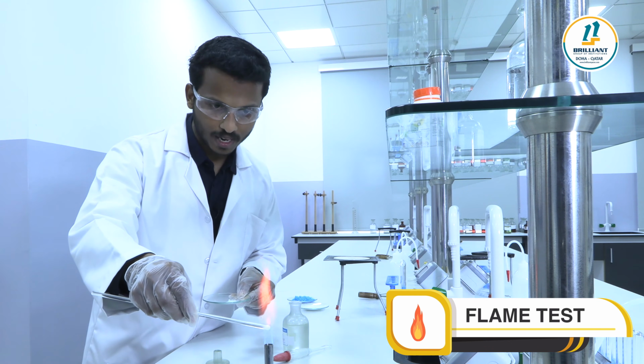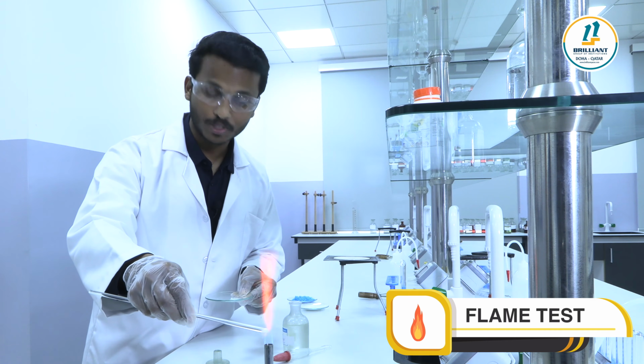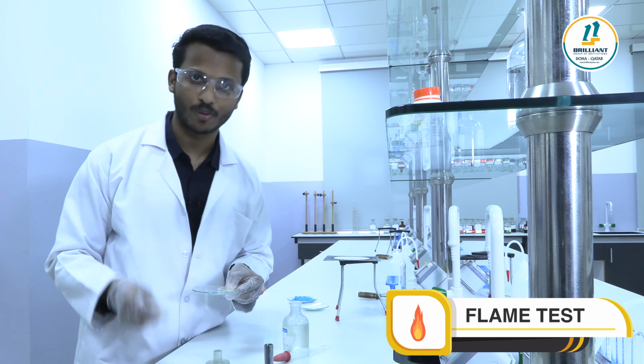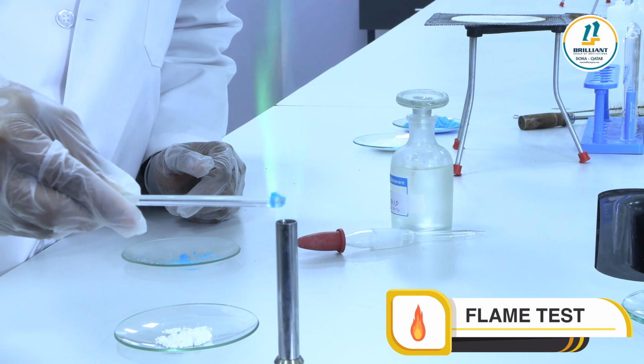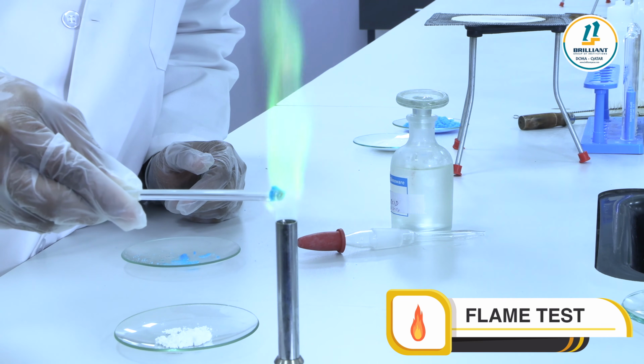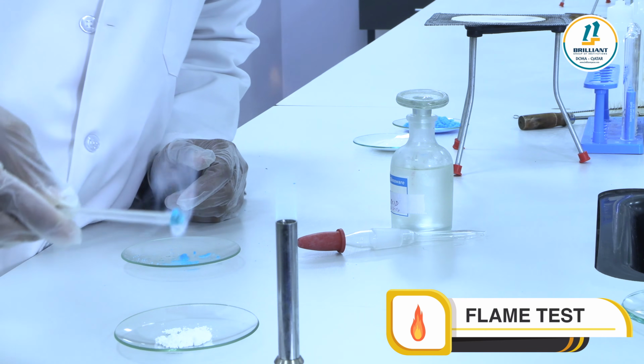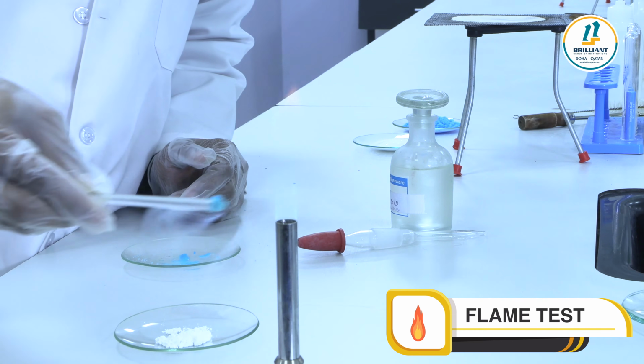There is a brick red color generated, which indicates it may contain calcium as a cation. This is the flame test for calcium. Let's see the next one. You can see that it's bluish green in color, which indicates that it may contain copper as a cation.